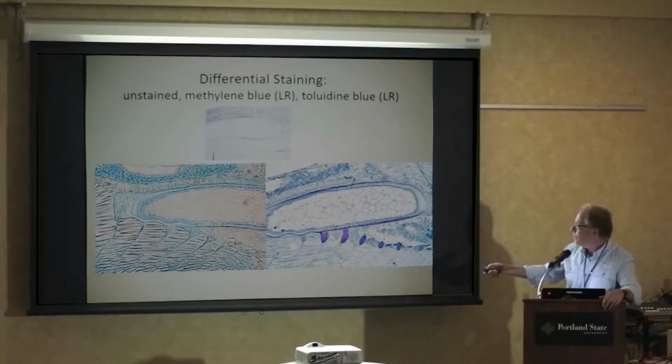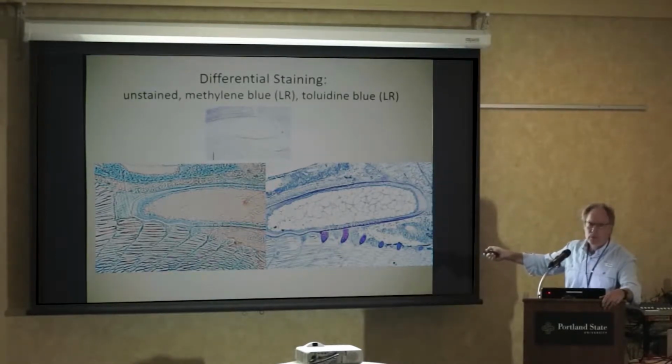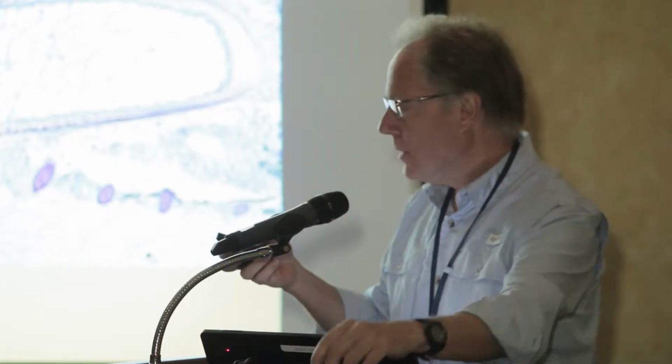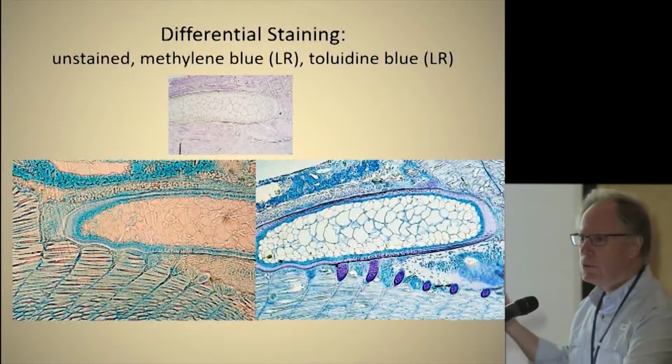Again, notochord here, notochord here, but you can see the distinction of this blue layer here, which is actually ectodermal, and I'll come back to that one, and this layer on the outside that is actually the collagen mesodermal layer. So you're getting some differentiation between tissue types here, but this is really dramatic. This is muscle, and it's not specific for muscle, but this is cartilage. This is the hyaline cartilage that is basically making the original framework for the gill lattice. And you can clearly then distinguish between tissue types based on that simple choice of stain.